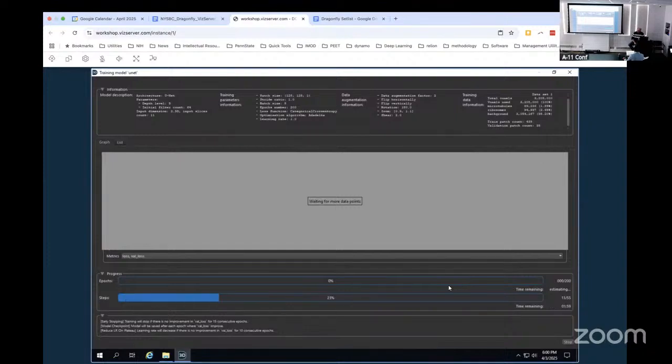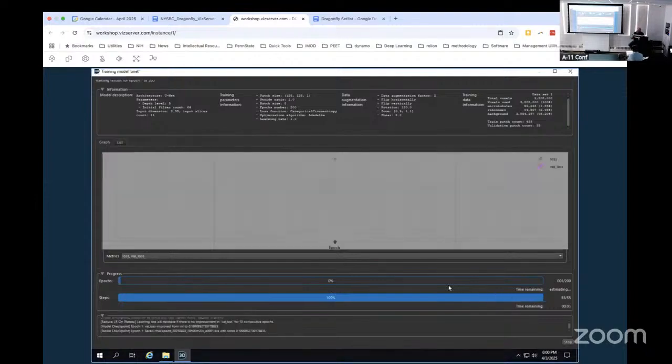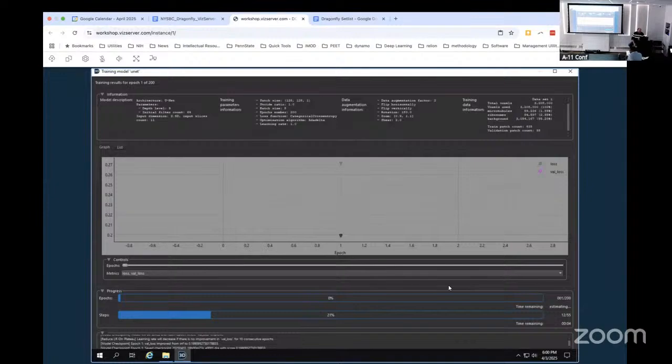I wasn't going to actually train anything while we were here, but then we got these online instances and it's actually not too slow. I figured I would, because yours is already training over there. All right, cool. Any questions to this point? Because we'll have a few minutes, we can talk about some stuff. Feel free to go to the restroom, get a drink.